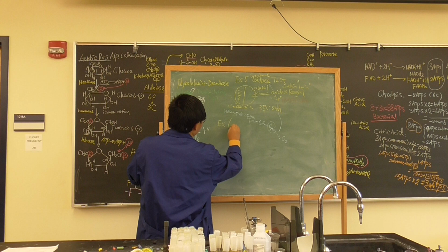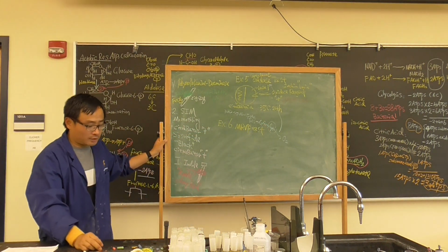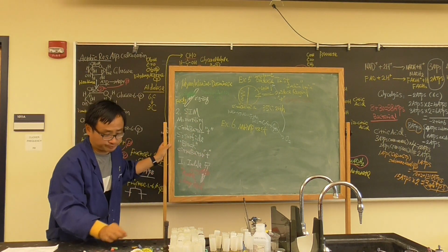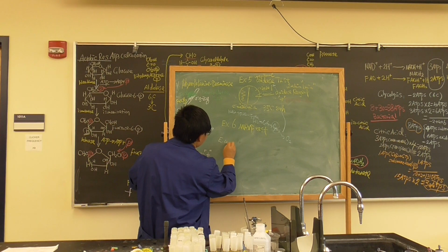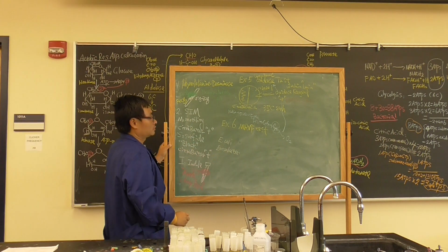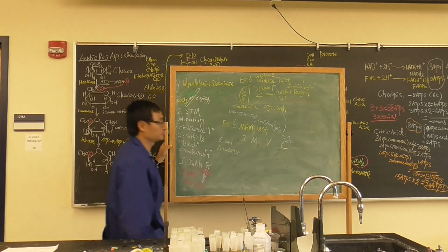Last test, what are we going to do? The MRVP test. I will redraw this on the blackboard next time and make sure you understand it very well. This is a series of tests used to differentiate E. coli and Enterobacter. This series is called the IMViC test.